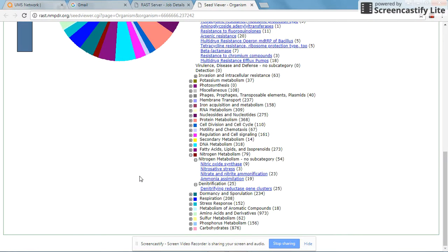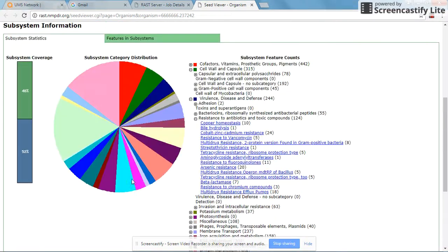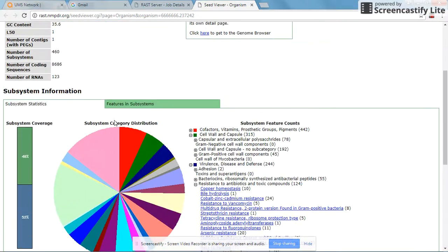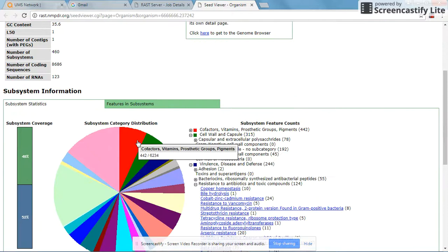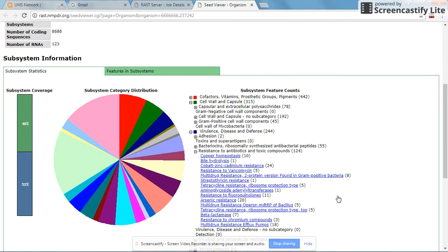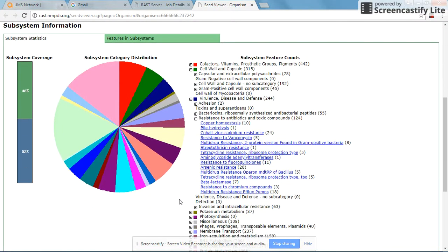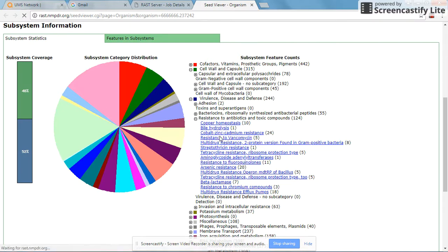This is an overview of the RAST annotation system. Now let's look more deeply. For instance, you have resistance to vancomycin. Click on this. It will show you the subcategory and the genes associated with vancomycin resistance.